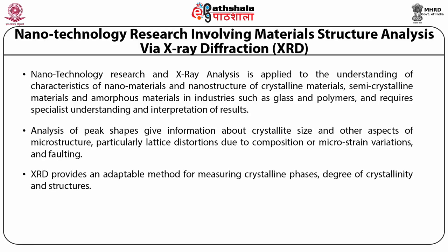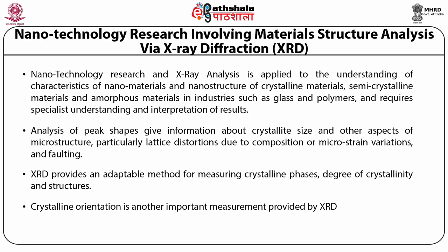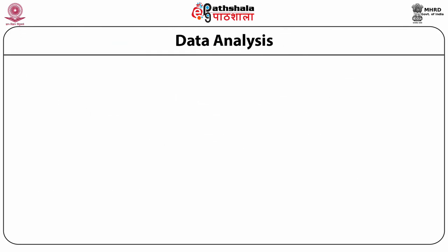XRD provides an adaptable method for measuring crystalline phase, degree of crystallinity, and structure. Crystalline orientation is another important parameter that is provided by the X-ray diffraction technique. We will discuss how to analyze the data obtained from X-ray diffraction.